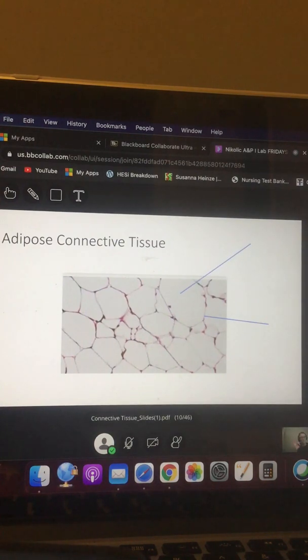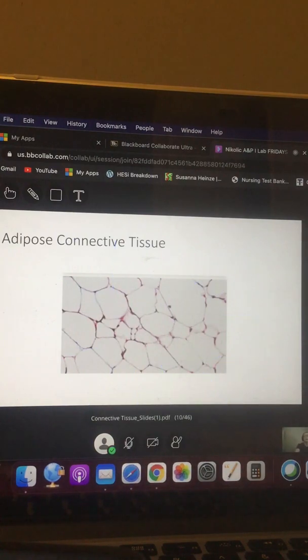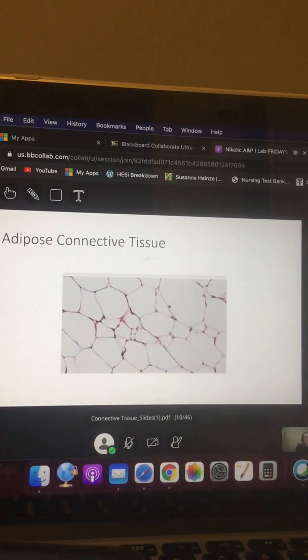Got it, guys? And how do we know that? Because I don't ask for the cell membrane. In that way, there's no confusion, right? So is the first line a cell membrane? Yes, it is. Am I asking for it? No, I'm not. So you're going to tell me that's the adipocyte. CYTE means mature cell, fat, adipocyte. And then the middle part of all these cells are the fat vacuoles. And then for the nuclei, we're just going to point to a little black thing there, and you've got your nuclei, or nucleus.